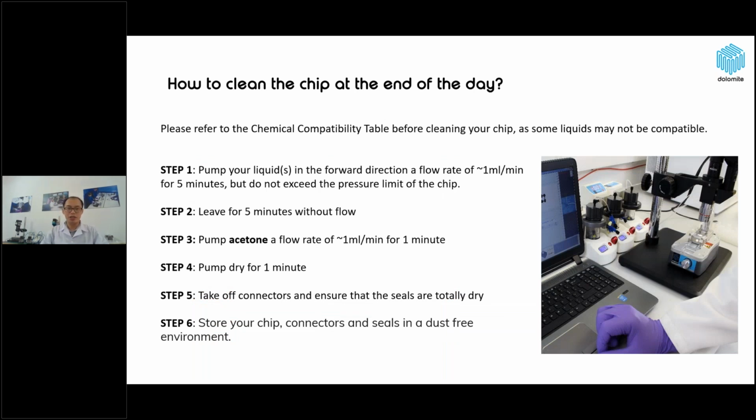And to prevent the chip blocking during the experiment, please follow the procedure to clean the chip at the end of the day. The liquid used should reflect what has been used during the experiment or be miscible with it, for example water, organic solvent or oil, but without the active ingredients. So it means you have to use the blank solvents that you are using during the experiment.